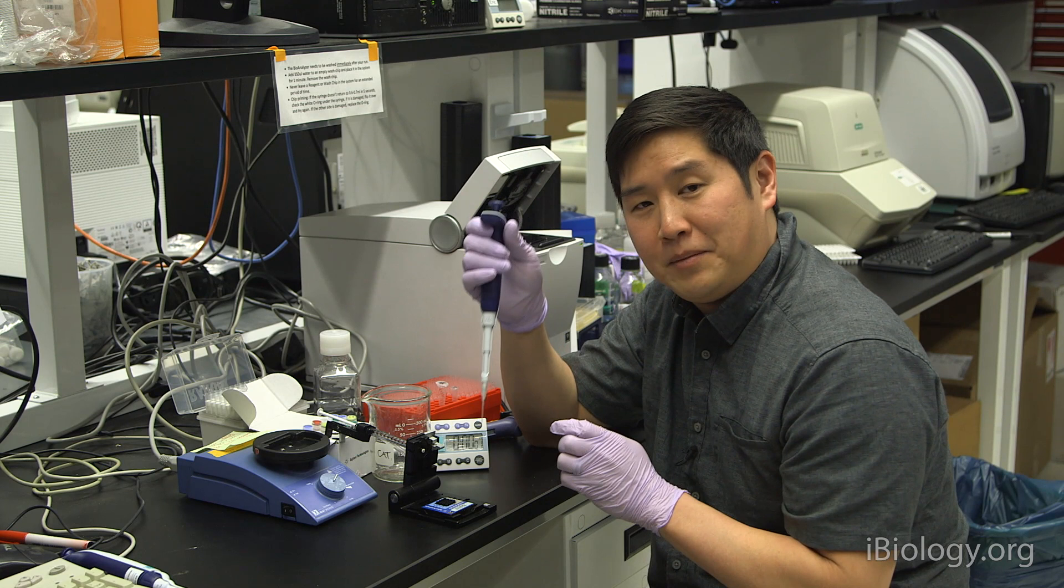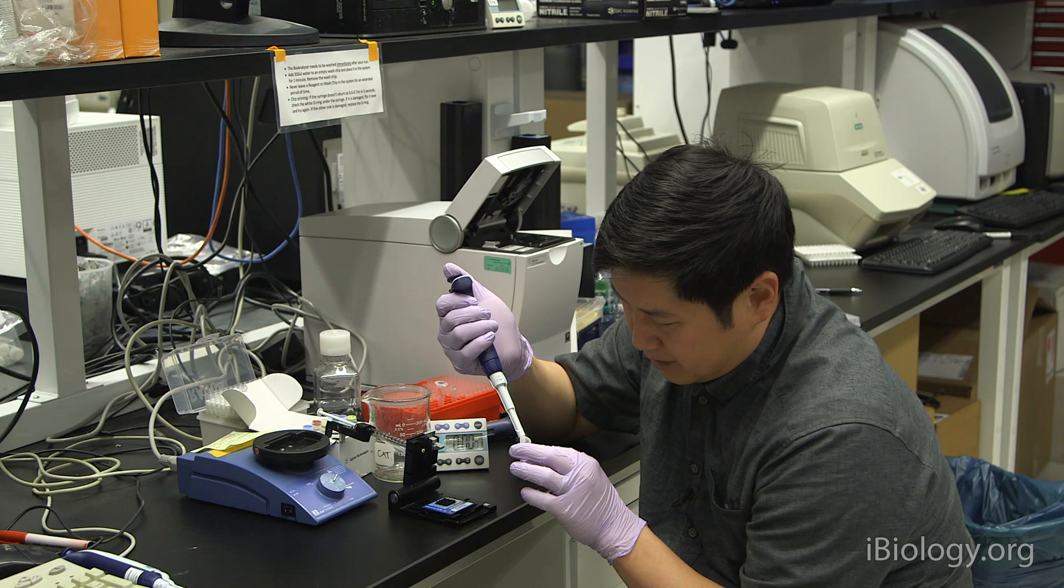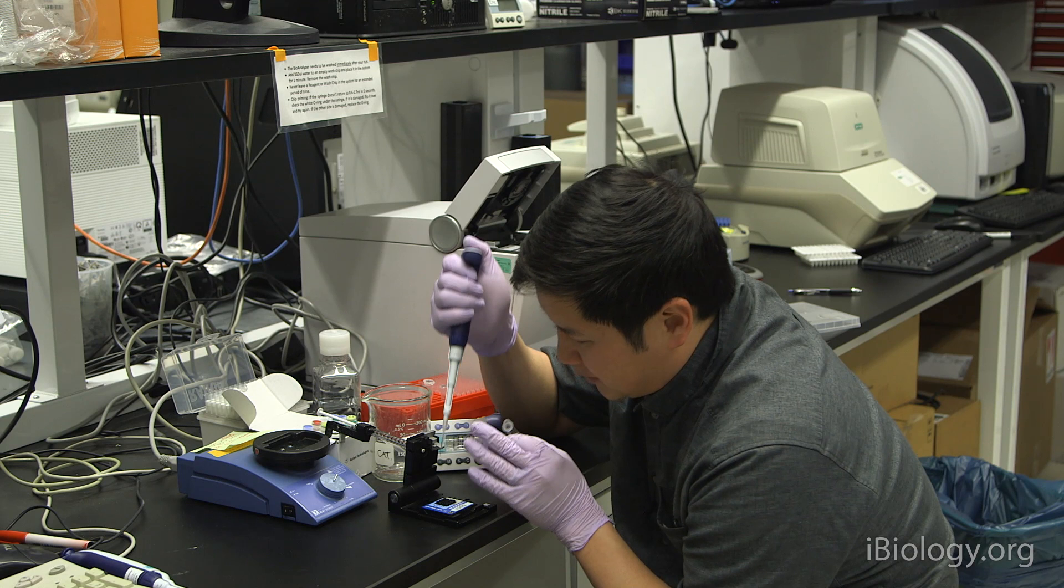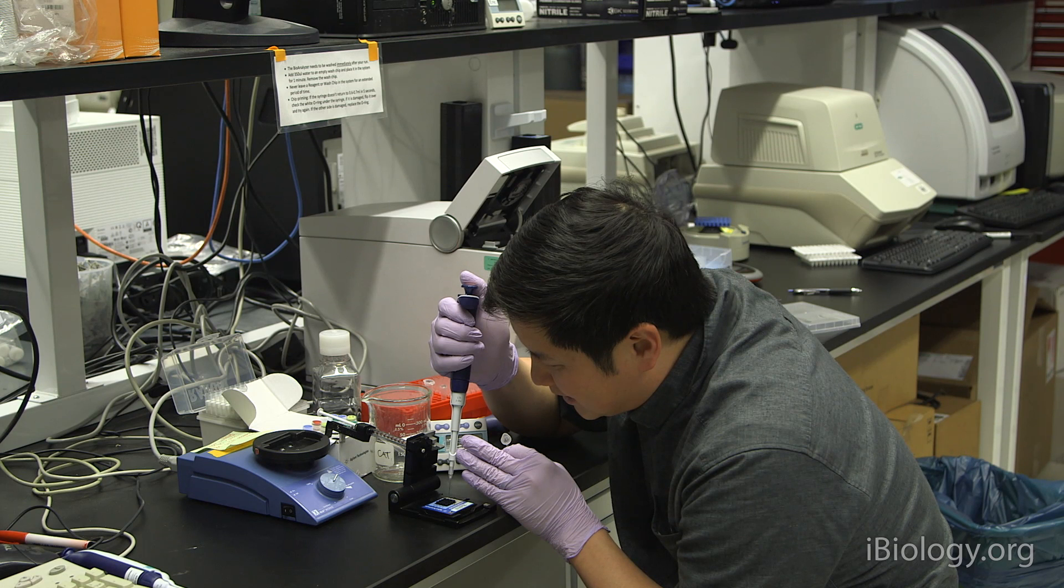Next, we'll add another 9 microliters of the gel dye mixture to the other three gel positions on the chip. These are the other three wells on the right side of the chip. You can use the same pipette tip for all of these, and again, just remember not to expel any air bubbles towards the bottom of the wells.